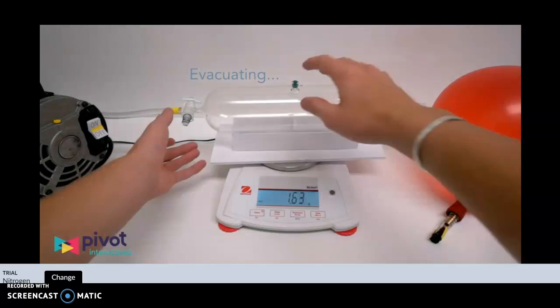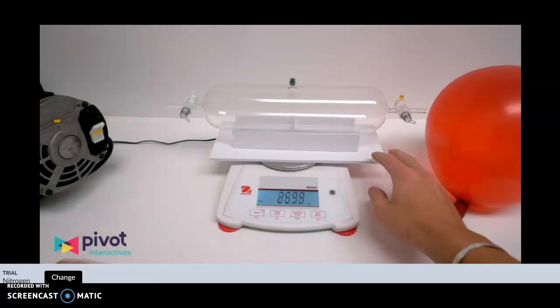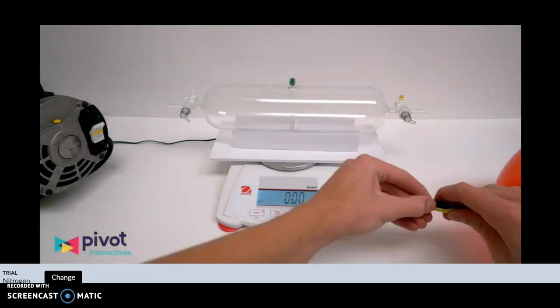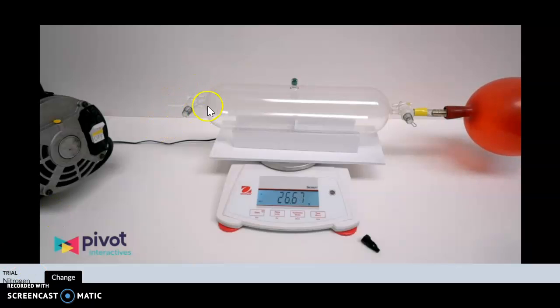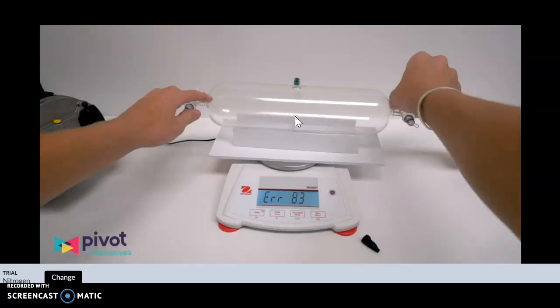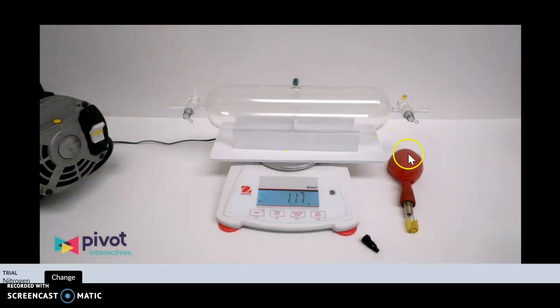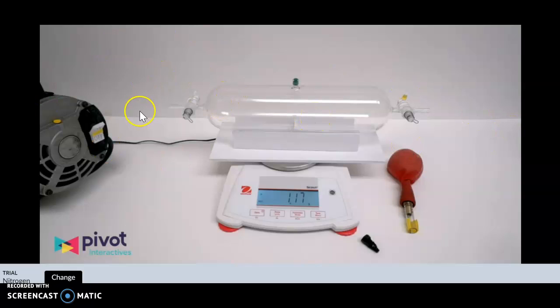We're going to evacuate this glass container — remove all the air. Once the air is gone, we set the mass of that glass container equal to zero on the balance. Then we put nitrogen in. They've opened the other end so that the pressure inside the glass container is one atmosphere. The balloon connection is removed so that all we have on the balance is the glass flask holding our gas. The volume of the flask is one liter.